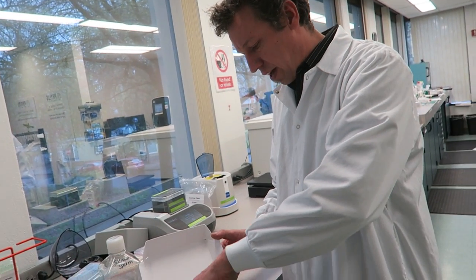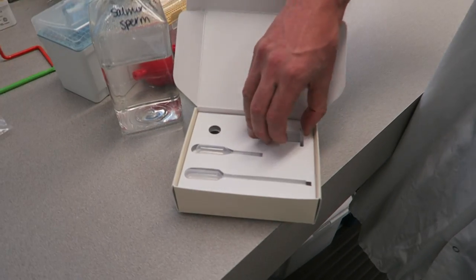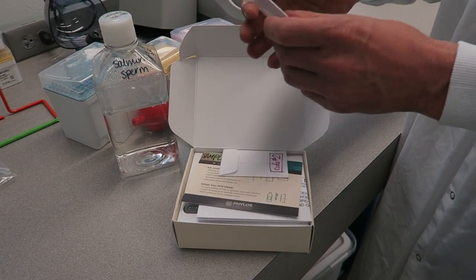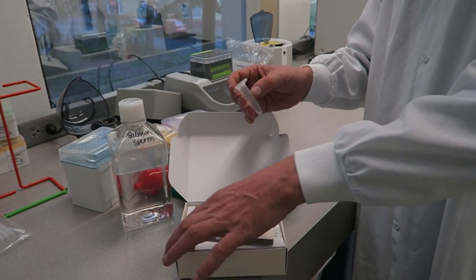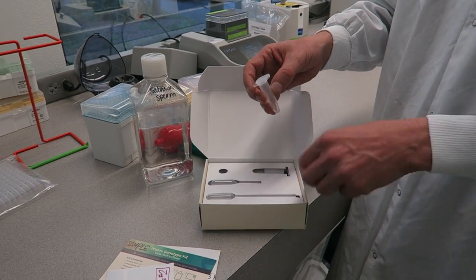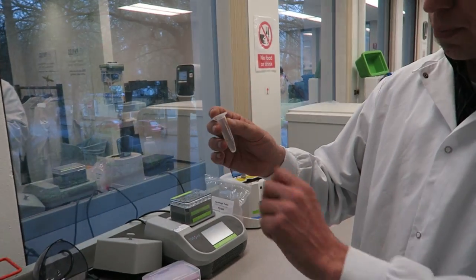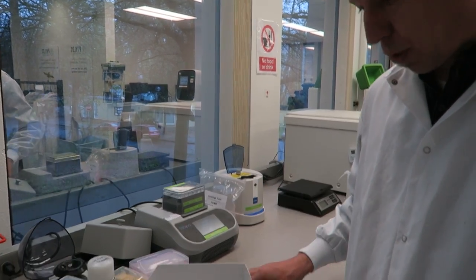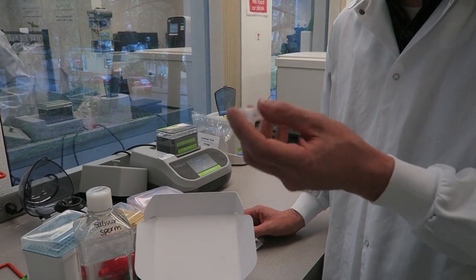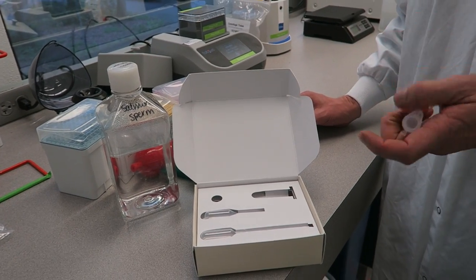What it has is a five mil tube that you put a piece of stem in — one gram or a couple of inches long, maybe three inches long. You put isopropanol in it. There are some pipettes to add and remove. Isopropanol — that's just rubbing alcohol, very simple stuff you've got at home. You put in a couple of mils in there and you shake the stem and isopropanol for about 30 seconds, then remove the isopropanol and do it again. Do a total of three times.